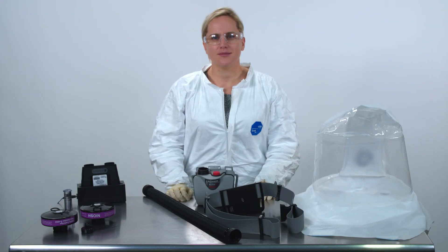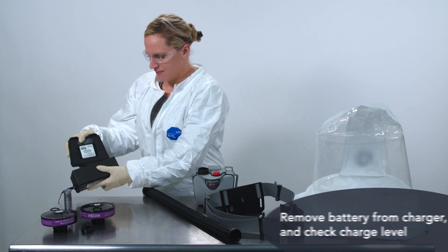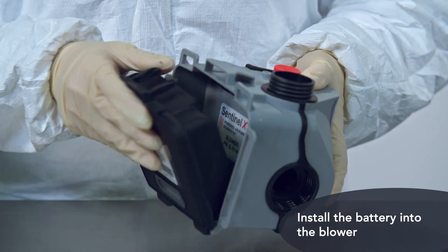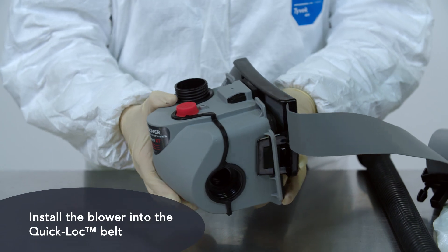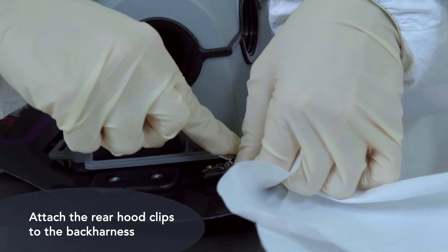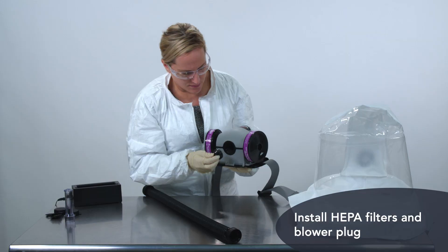Now let's watch how quick and easy it is to prepare and don the Sentinel XT Clear system. Remove the battery from the charger and check to ensure that it's fully charged. Install the battery into the blower, then install the blower into the quick lock belt or back harness. Attach the rear hood clips to the back harness. Install two HEPA filters into the blower unit and install the blower plug.